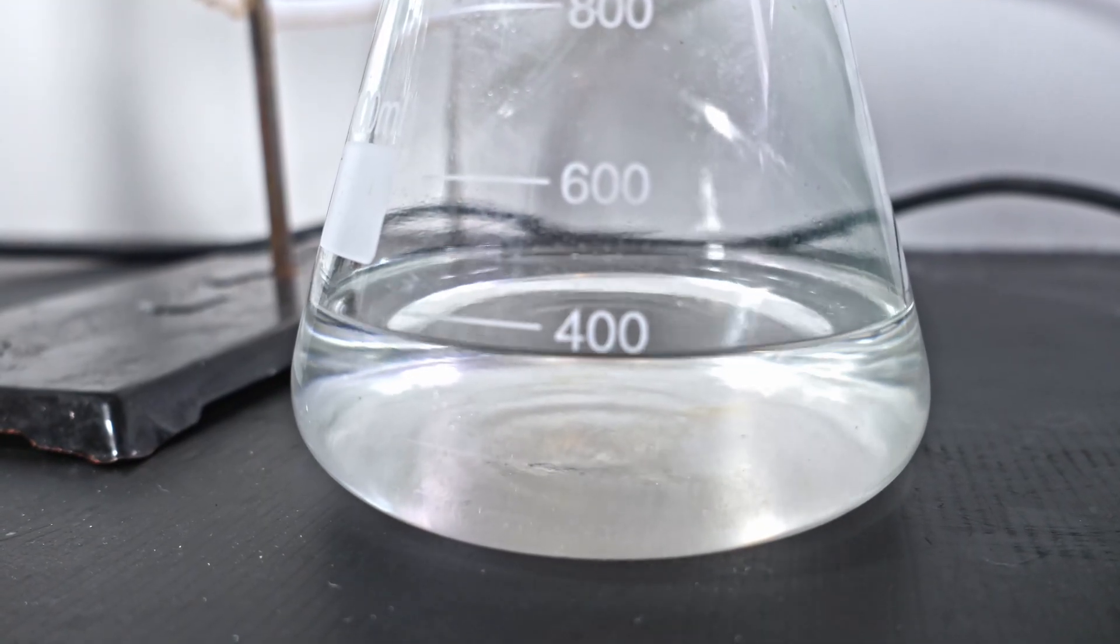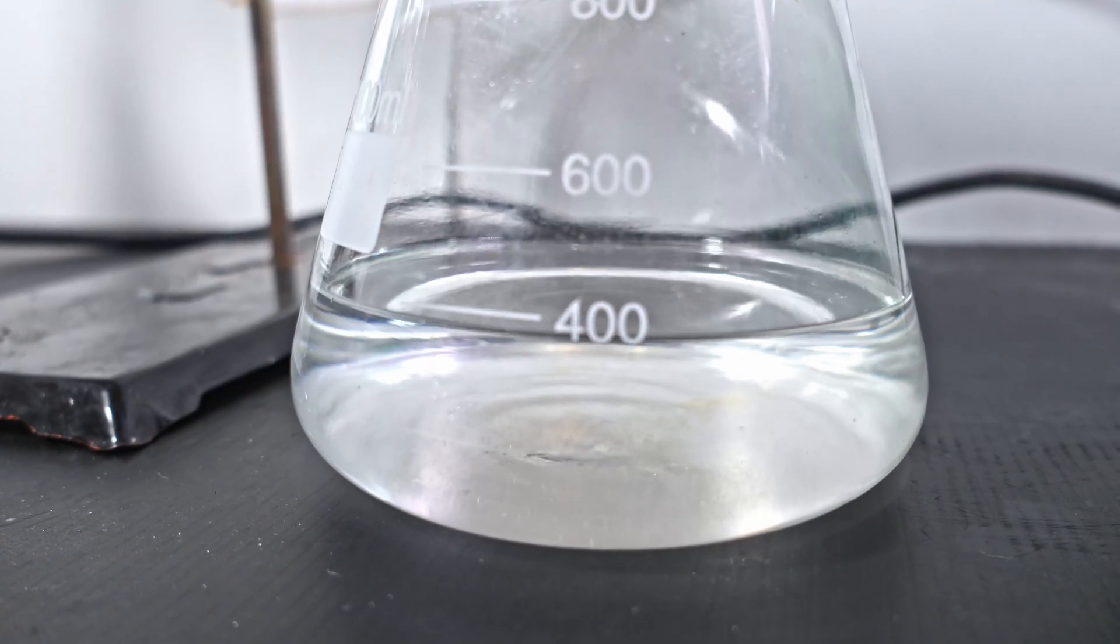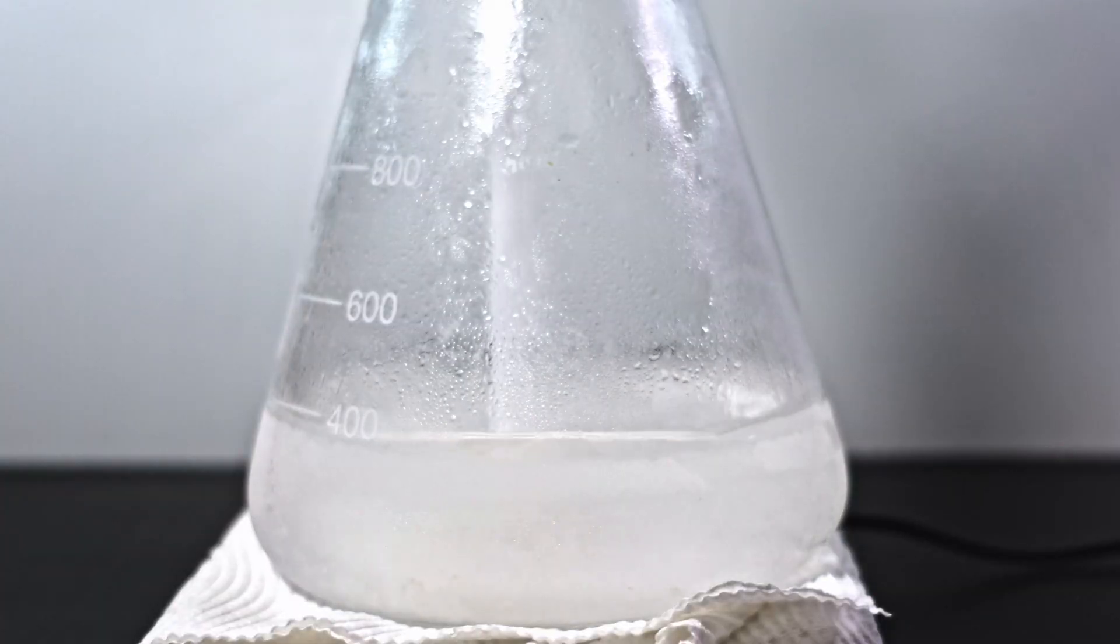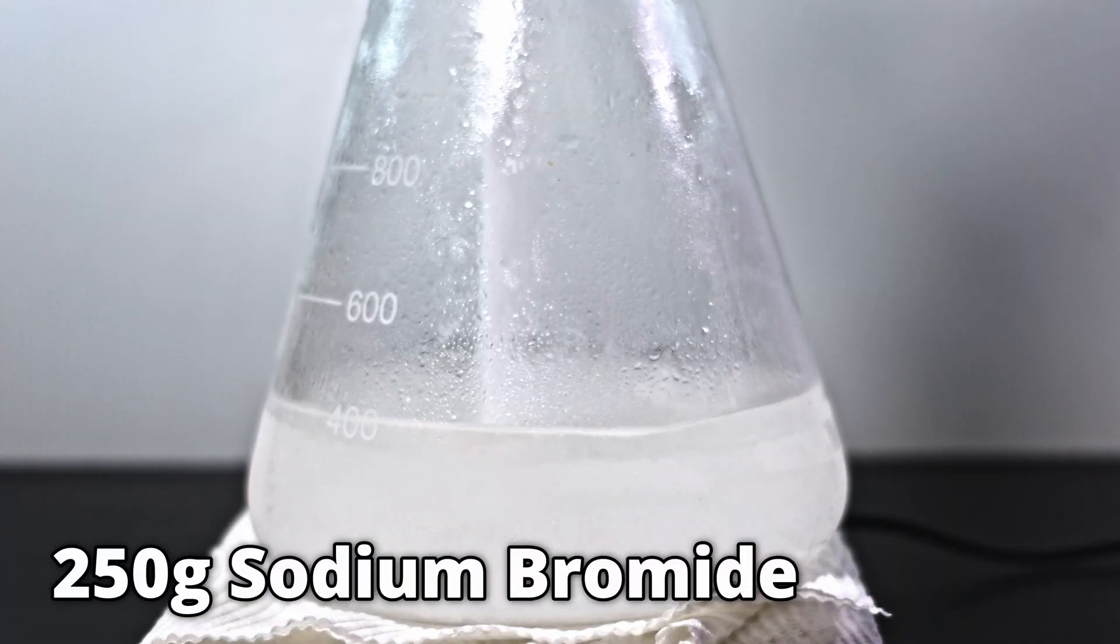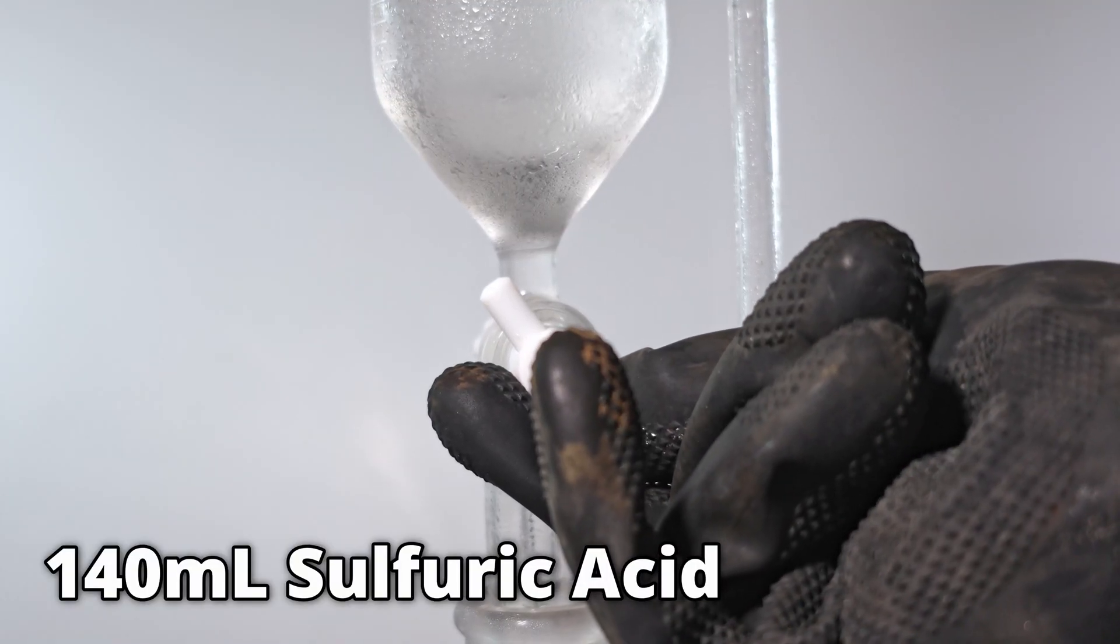If you recall, I started with 300 milliliters of ethanol so the growth in solution is a good sign we have some product. I do the same procedure, pouring in another 250 grams of sodium bromide and slowly dripping in 140 milliliters of sulfuric acid.